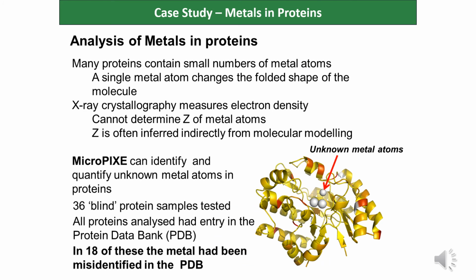So in this study we're identifying the metal atoms at the heart of metalloproteins. The technique using micro-PIXE was developed by Jeff Grime and Elspeth Garman at the Surrey Ion Beam Centre. It's difficult to identify the metals in the proteins using conventional X-ray crystallography, and normally the metal is identified by simulation of the protein structure rather than by any direct evidence.